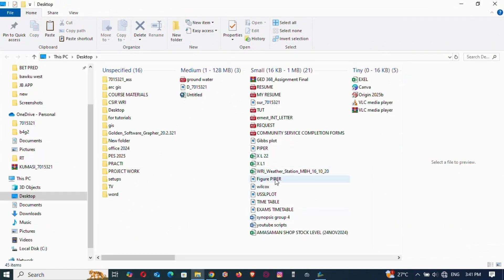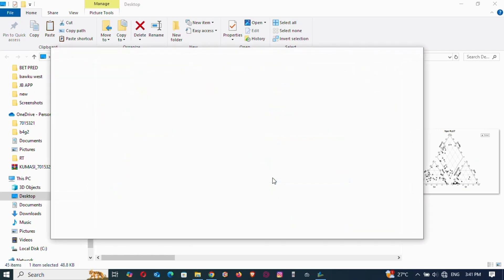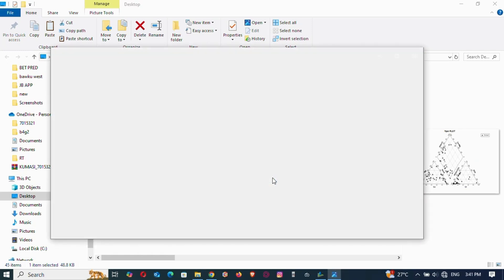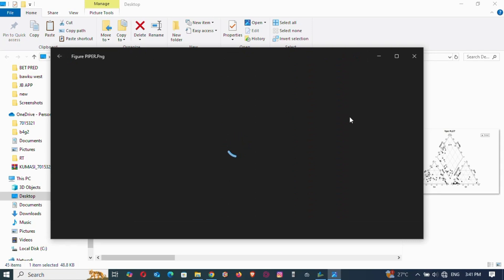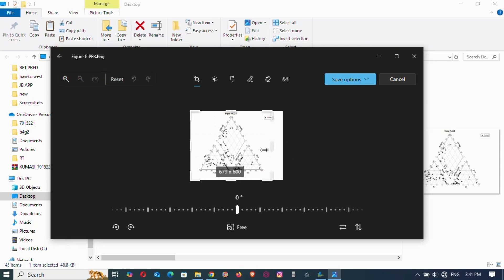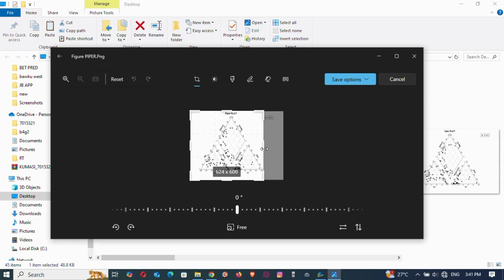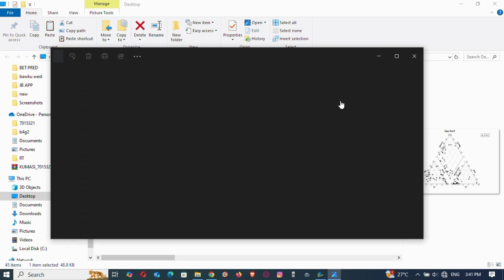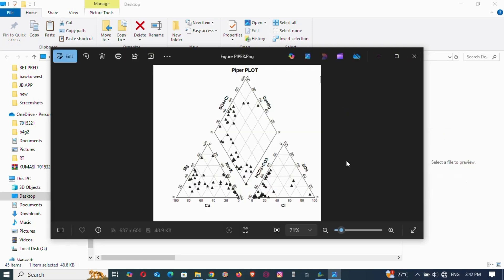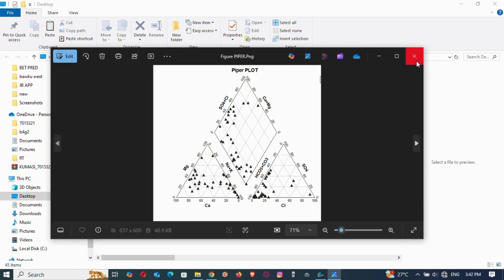The image is generated — open it to see. We named it 'figure piper' — there it is. This is our Piper figure. You can trim that extra part when exporting by using the edit option to cut it out. This is how to plot the Piper using AquaChem software.